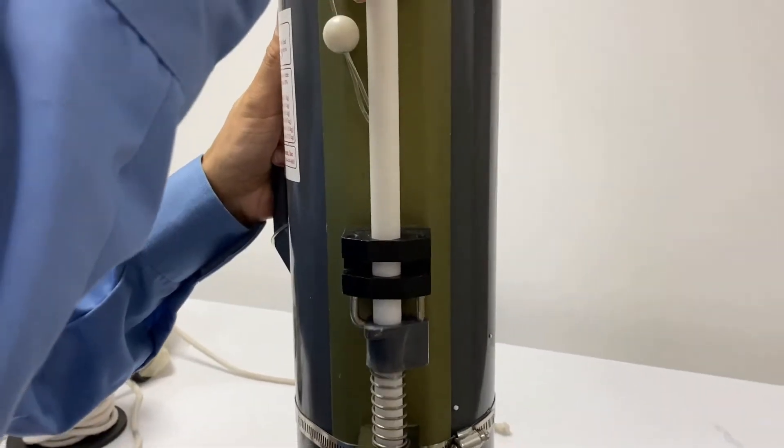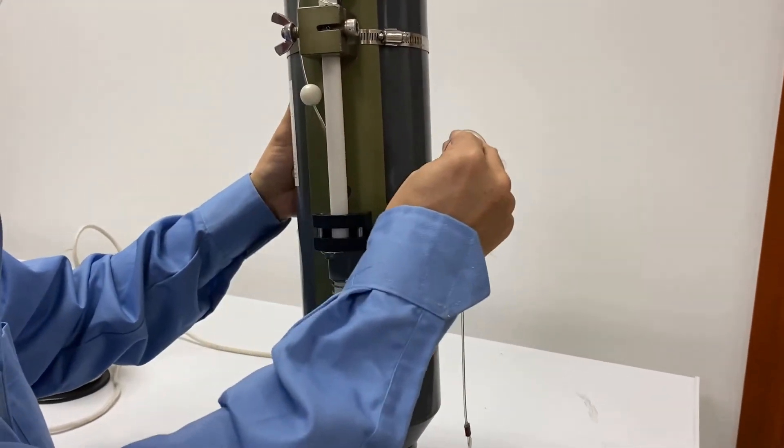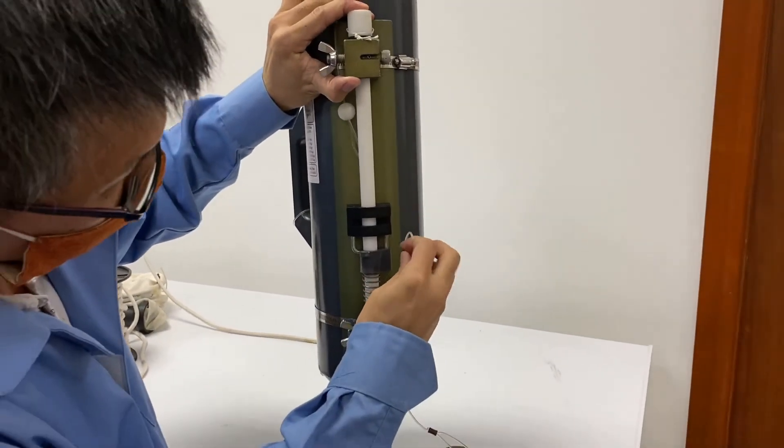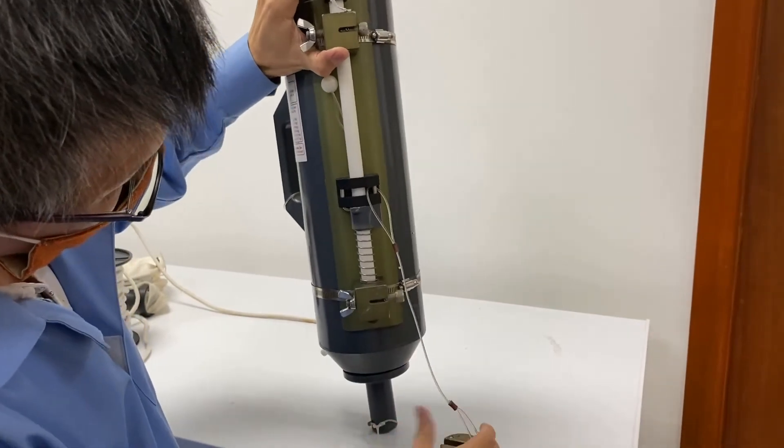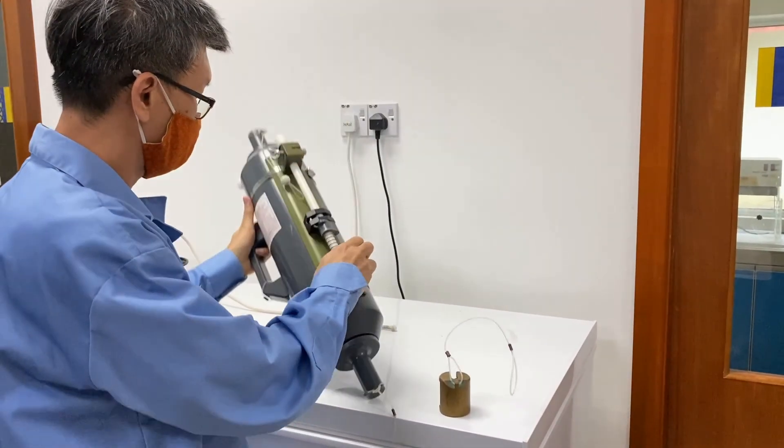Sometimes when you have multiple samplers on one cable, you can see there are extra hooks here where you can latch another messenger onto the Niskin sampler. When you have multiple Niskin samplers, the trigger by the messenger will not only close the Niskin sampler but also release the following messenger for the Niskin sampler at deeper levels. This creates a cascading movement where one messenger at the top will trigger all the messengers for the Niskin samplers at deeper levels.